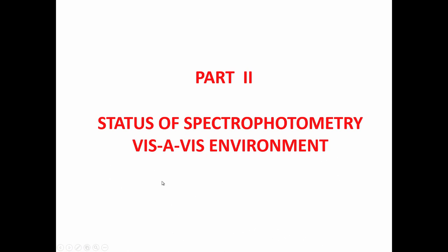So, what we are concerned with in this course is the environmental pollutants. Therefore, I will be concentrating mostly on the status of spectrophotometry vis-a-vis environment. That too, the environment I have chosen is the aqueous environment, that is water bodies, effluents and any other process chemicals that need to be monitored for their parameters.